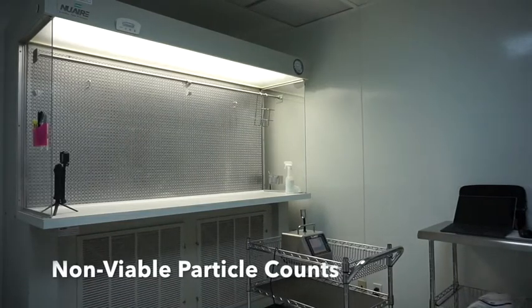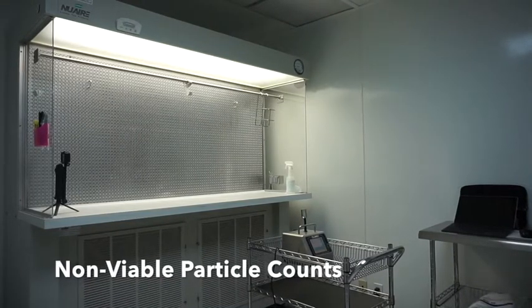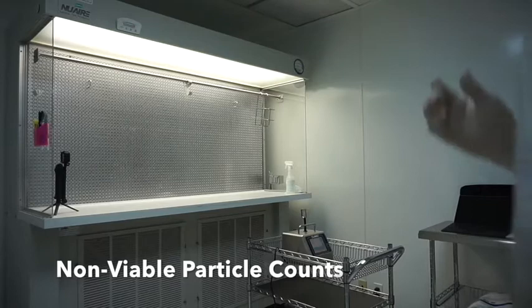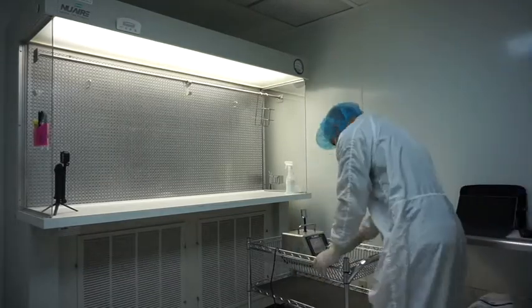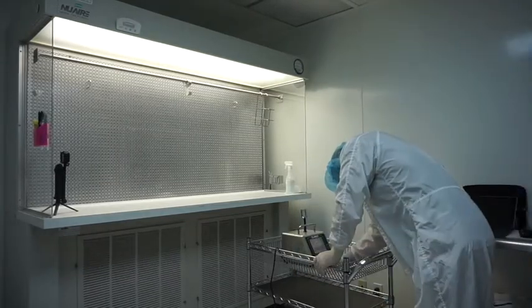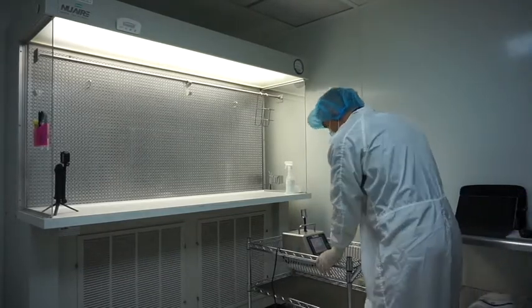This test is the non-viable particle count. This test will help you classify your room to meet ISO 7 or ISO 8 conditions.